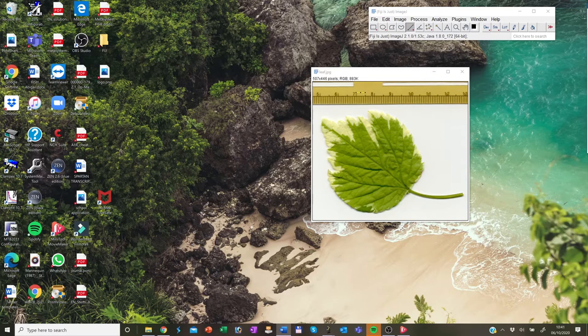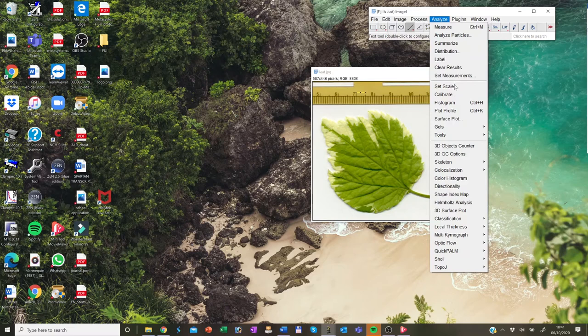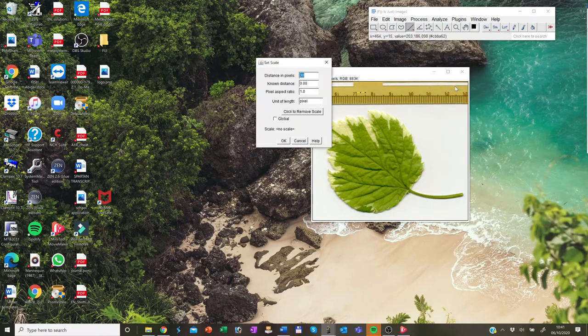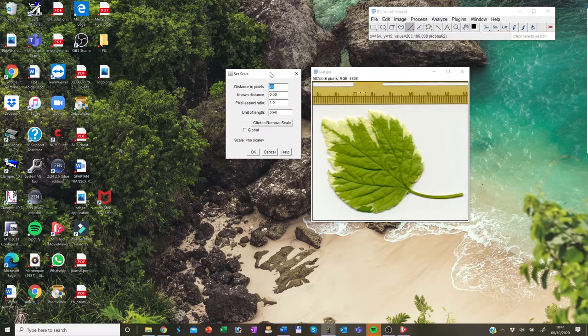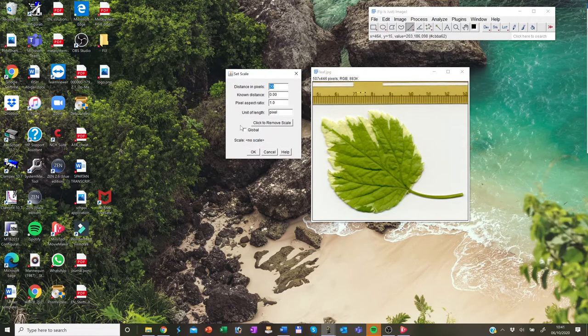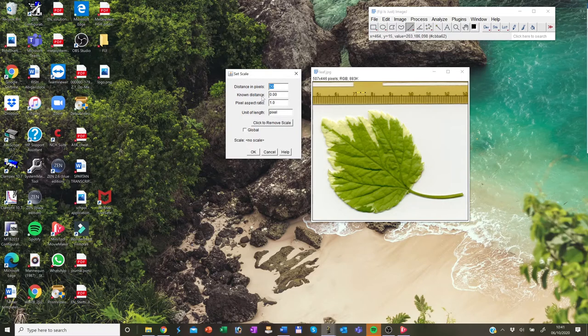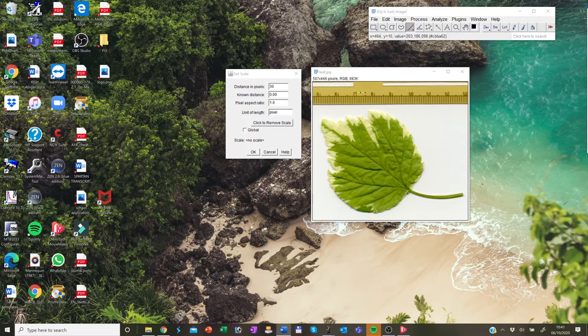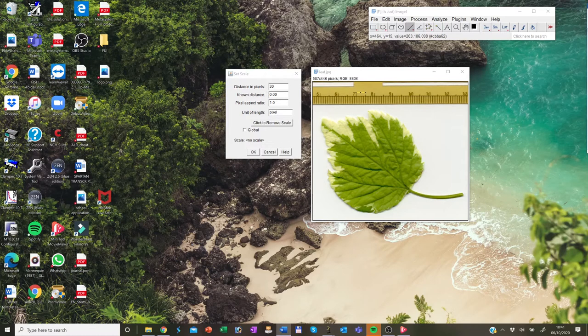Next, you go into analyze menu and then you select set scale and the dialog window will open. Now the distance in pixels, it will be filled in for you based on the length of the line that you drew before. And so what you need to do is fill the known distance.